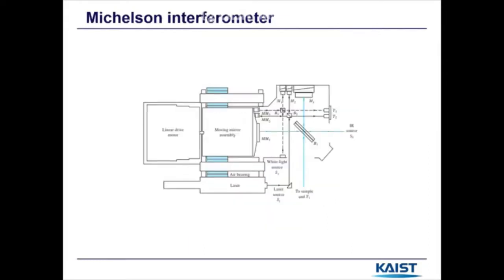The majority of commercially available FTIR instruments are based on the Michelson interferometer. The Michelson interferometer is a common configuration for optical interferometry and was invented by Albert Abraham Michelson. Using a beam splitter, a light source is split into two arms. Each of those light beams is reflected back toward the beam splitter, which can combine their amplitudes using the superposition principle.